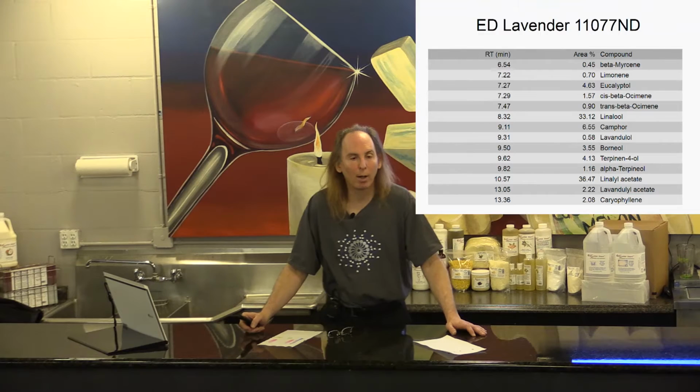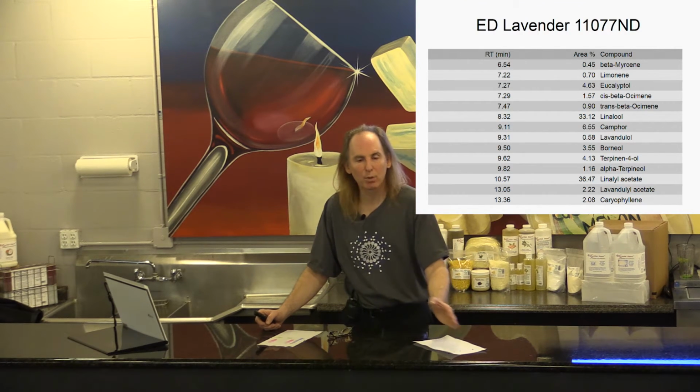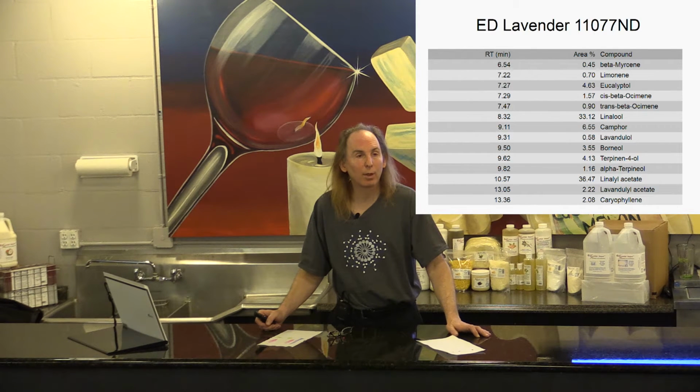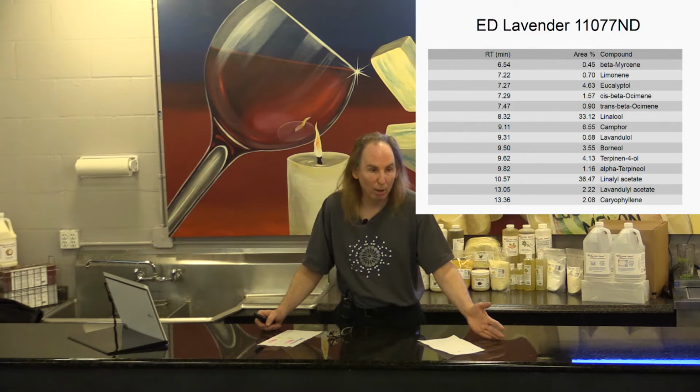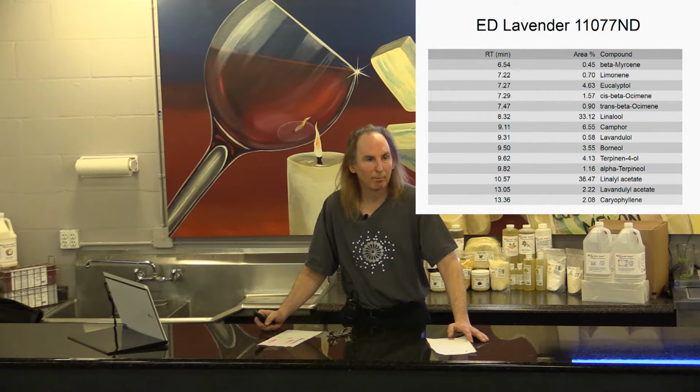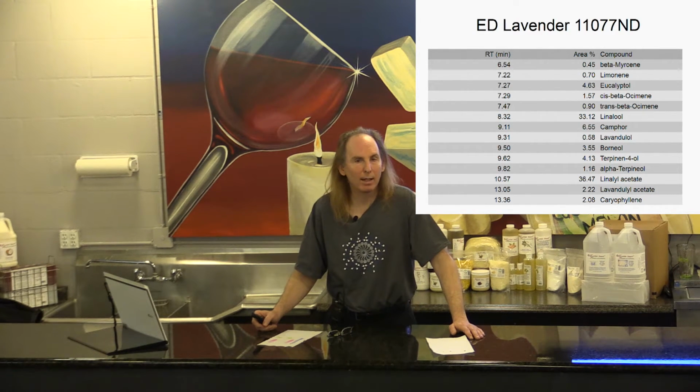But even if I had 2 different samples of a genuine lavender oil, they may be quite different, and you'll be surprised at how different they can be. I'll be talking about that tomorrow, and you'll see. Is that like a report from a genuine lavender oil? So it's not enough to have one. I need multiple so we can compare.